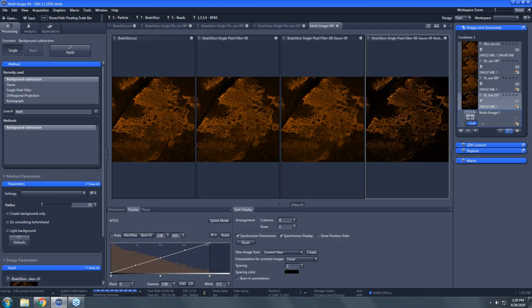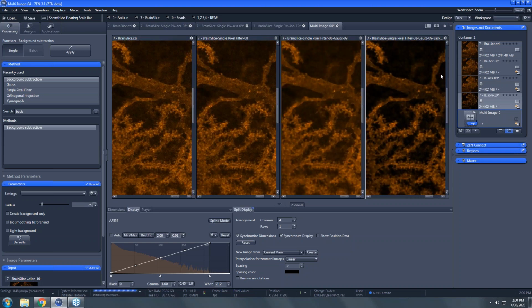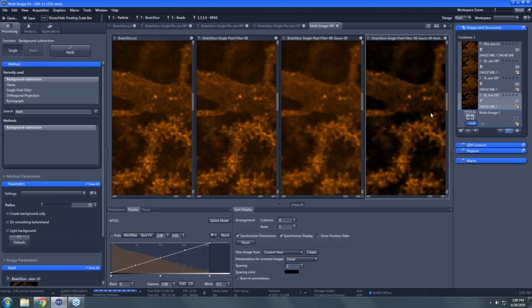Perfect. And then let's zoom in on some region that will have some interesting features, some spines somewhere, something that's in focus. I'll go to my favorite spot. Okay. Lovely. I like it even more, I would say. Let's go right in until we see, yeah, so we can see the features of these cell extensions. And we can see from the left to the right how much we're getting rid of this speckle noise, probably most of which is shot noise, knowing how this was acquired. So noise that we can't control, noise that isn't instrument specific.